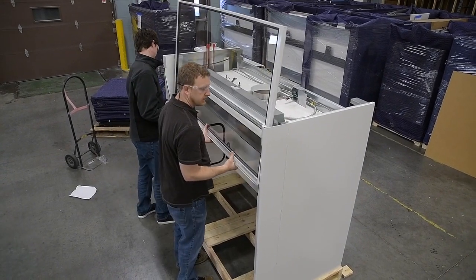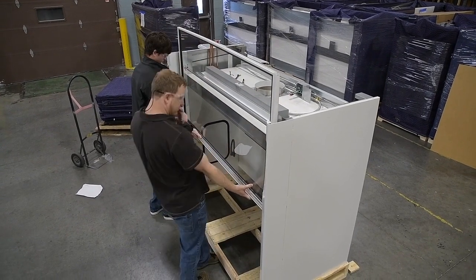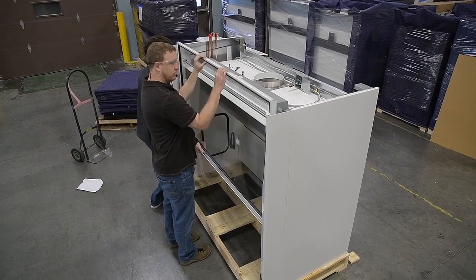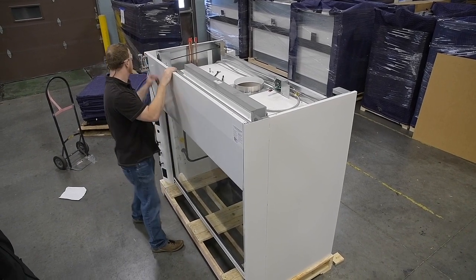Once the chains are back secured, you're going to lower the sash back down into the guide tracks. This is easier with two people as you can each support on each side. Monitor the sash chain so that way it doesn't get kinked up inside of the tracks. Once you've got everything secured, go ahead and put back on the front panel.